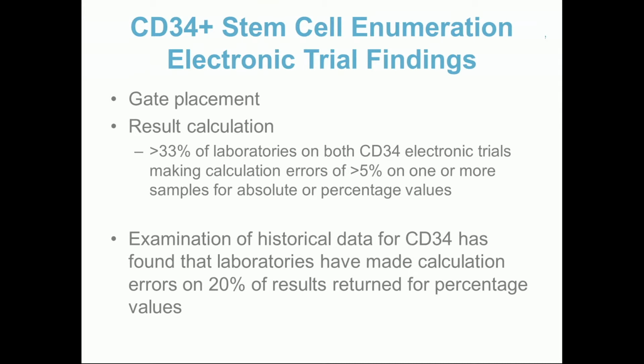When we looked back to 2004, to the last sort of 20% of the results don't match up with what's been entered. So either data that's been provided to us is being entered wrong, or laboratories are making calculation errors on their percentages, or a combination of both. But either way, that's worrying because we've got potentially issues with maths or issues with results transcription, both of which are quite concerning for us as an EQA program and for yourselves when you're getting things entered into different databases.